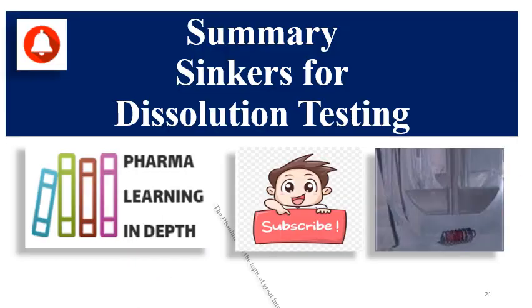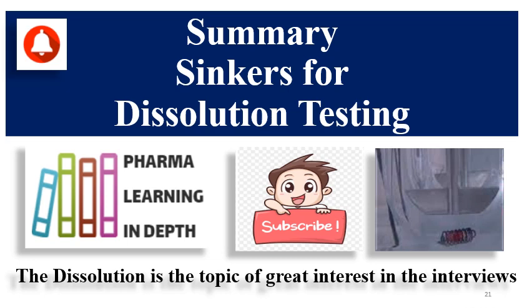Then coming to the summary, in summary we have seen the sinkers, their types, when sinkers are to be used, when sinkers are not to be used, and the best practices. I hope this video will give you a clear understanding of sinkers for dissolution testing. And dissolution is a topic of great interest for interviews.